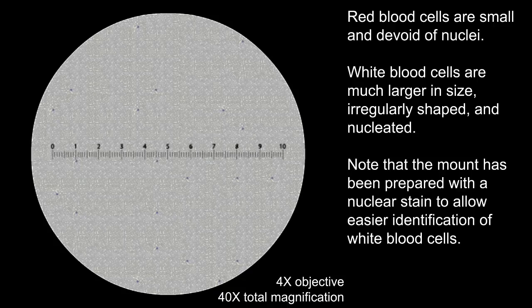Red blood cells are small and devoid of nuclei. White blood cells are much larger in size, irregularly shaped, and nucleated. Note that the mount has been prepared with a nuclear stain to allow easier identification of white blood cells.